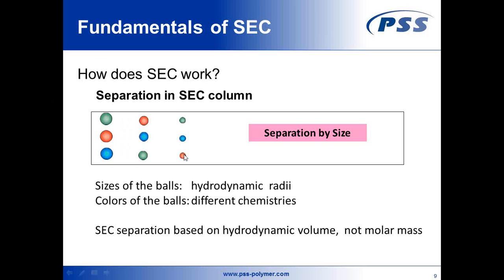And according to this type of separation, according to hydrodynamic volume, according to size, we will be able to separate monomers of a protein from a dimer, a trimer, and a higher aggregation, because the higher a protein is aggregated, the larger the hydrodynamic volume of the protein will be, and the better we are able to separate these sizes from each other, the more precisely we will be able to determine the degree of association.